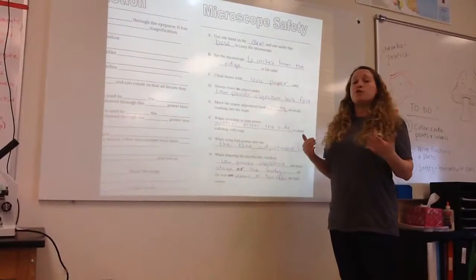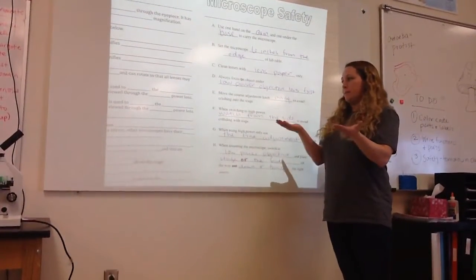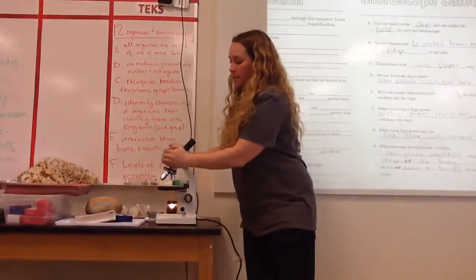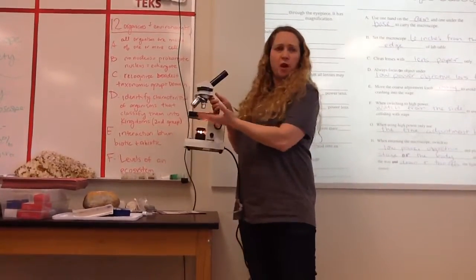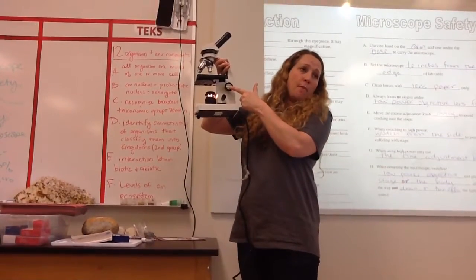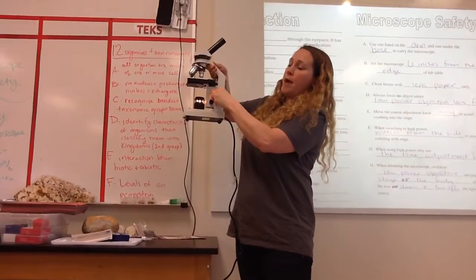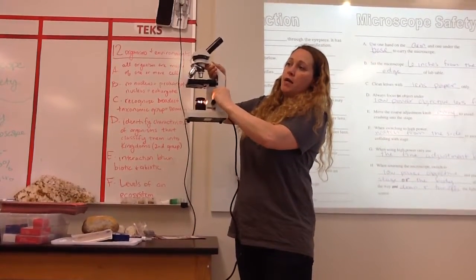Now, in order to view the object, this is where we have to talk about moving the stage up and down. Sometimes the stage is the moving part, and sometimes this part, the nose piece, moves up and down. In our microscopes, I'm pretty sure it's all the stage. I'm going to show you right now how to move it. You always start with the big knob, so when I turn it, you'll notice it goes up and down. Up all the way, down all the way.